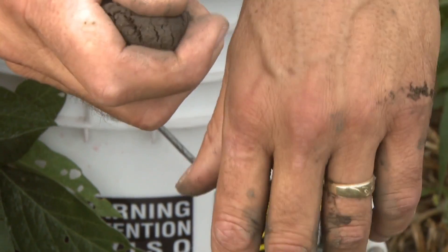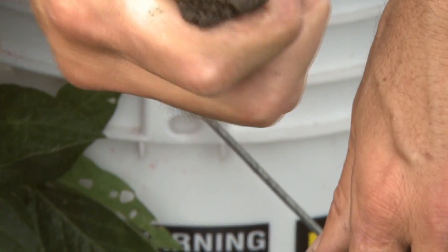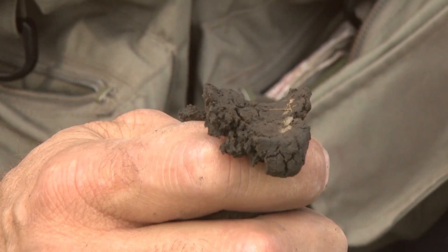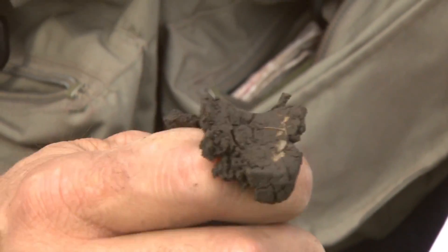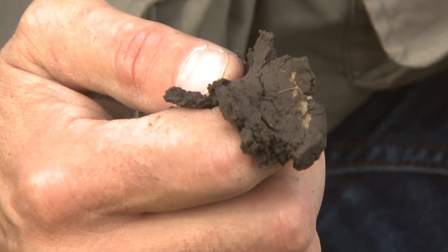The next step is to place the ball between the thumb and forefinger and gently push the soil with the thumb, squeezing it upward into a ribbon. Form a ribbon of uniform thickness and width and allow it to emerge and extend over the forefinger, breaking from its own weight. You can see it broke, so yes, it did form a ribbon.